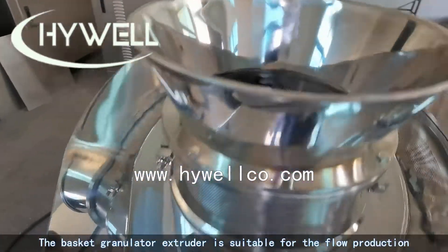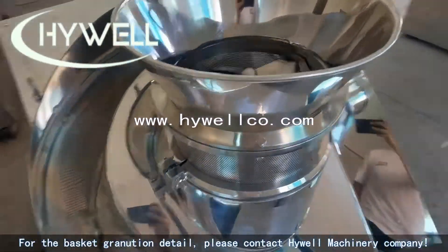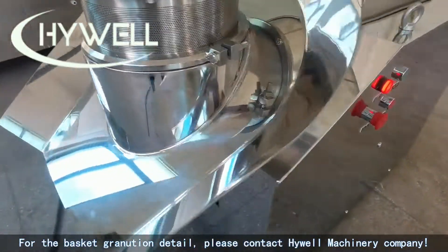The basket granulator extruder is suitable for flow production. For basket granulation details, please contact Highwell Machinery Company.